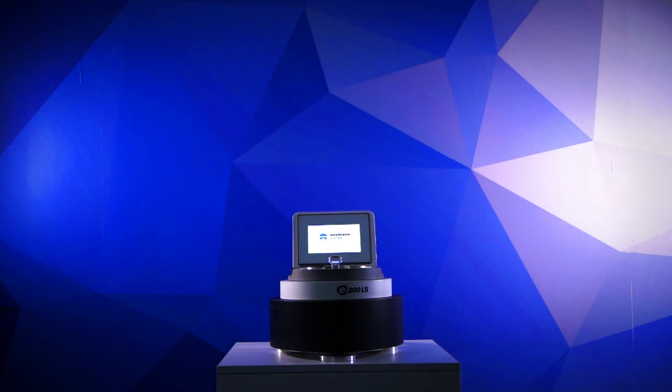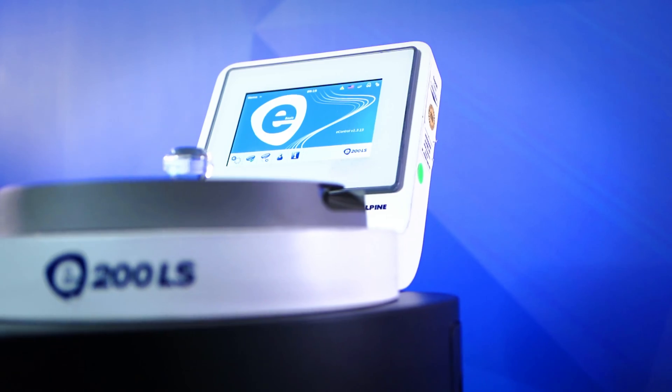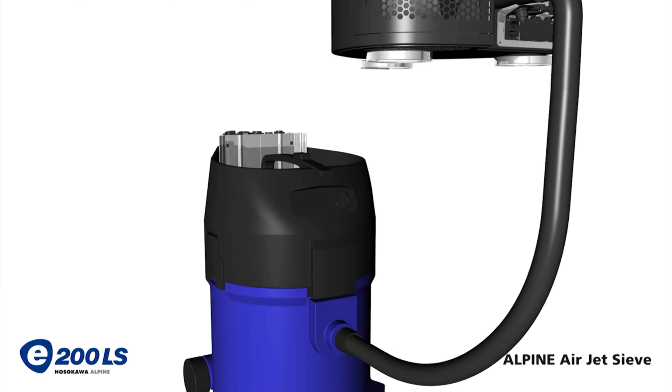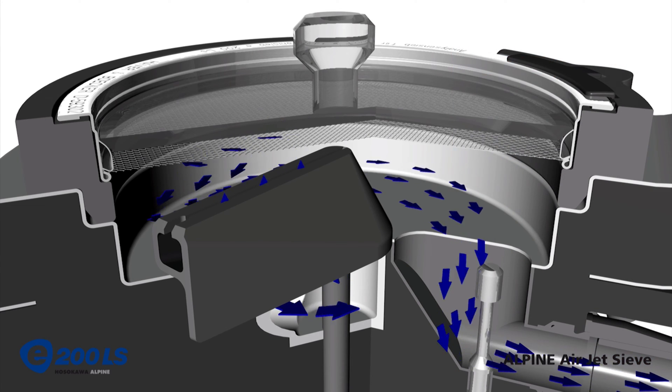The Alpine AirJet sieve E200LS is a particle size analysis instrument that, much like traditional sieve shakers, uses test sieves to separate particles to identify their size. What makes this Alpine unique is that it uses a stream of projected air to help the individual particles find the openings in the sieve cloth. This AirJet allows the Alpine to excel especially when testing fine particles, and because of that, this device can be found in most industry standards as a reliable ancillary testing device.